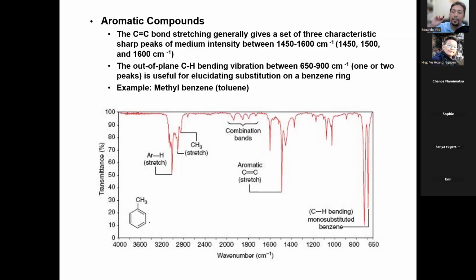Don't do that. Anyway, so this is still hydrocarbon, CH bonds, but now it's a little stronger because it's a double bond. So that means that the wave numbers are going to be a little bit different. So let's take a look. You have this really sharp peak at 3000 right there. A singular sharp peak at 3000. It is medium because it's about 50%. So I would call this medium sharp. Actually, very sharp, I would say. Medium, very sharp peak. And you can see from the x-axis, it is located at around 3000 wave numbers. That is specifically your aromatic ring C-H stretch right there. Make sense?